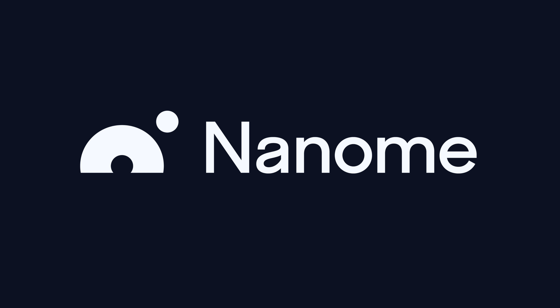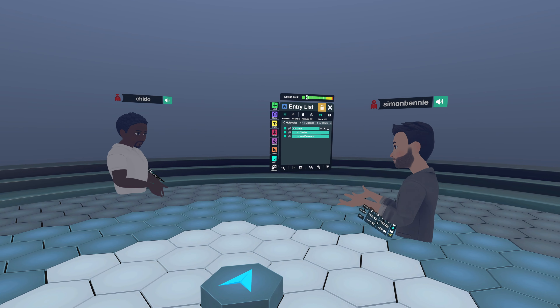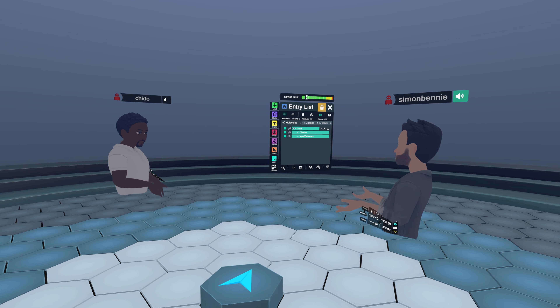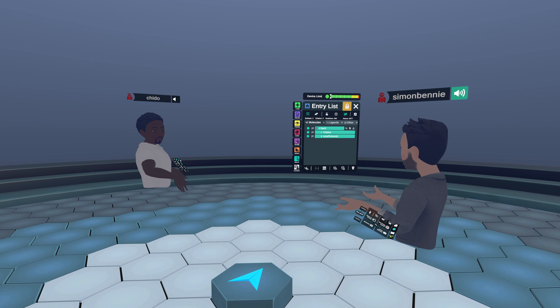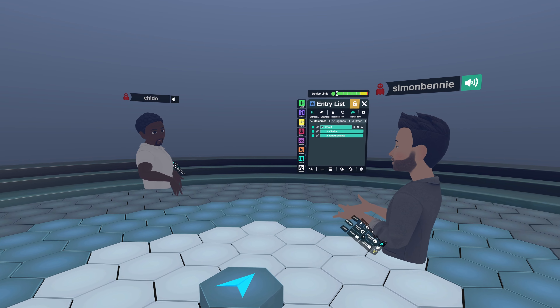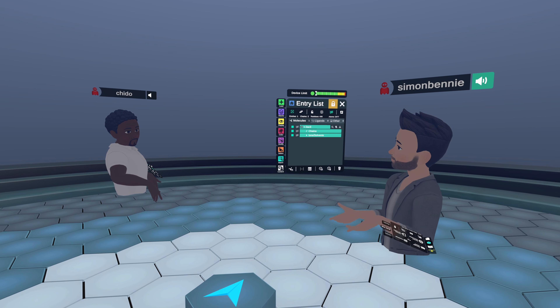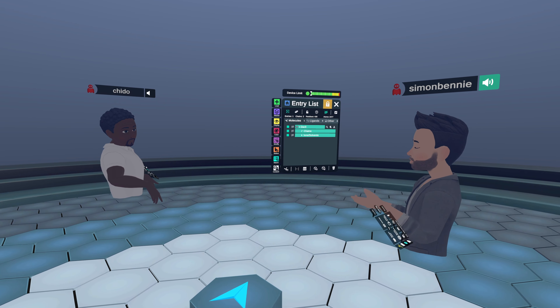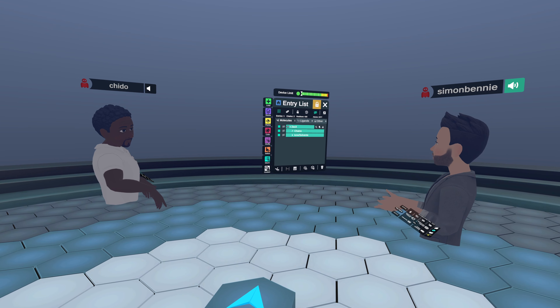Thanks again for taking us through how to use the scene viewer. To end this session, I'd like to quickly show people how you can easily load structures into Nanome and how it doesn't necessarily have to interrupt your workflows.